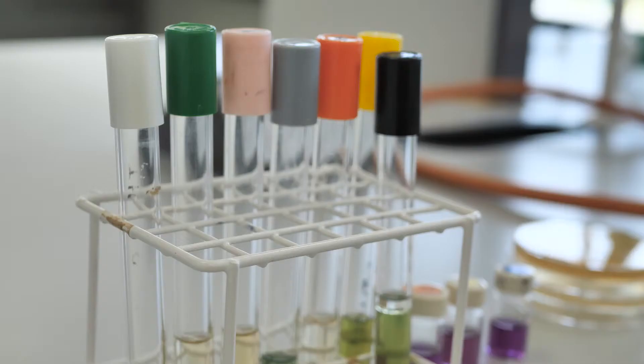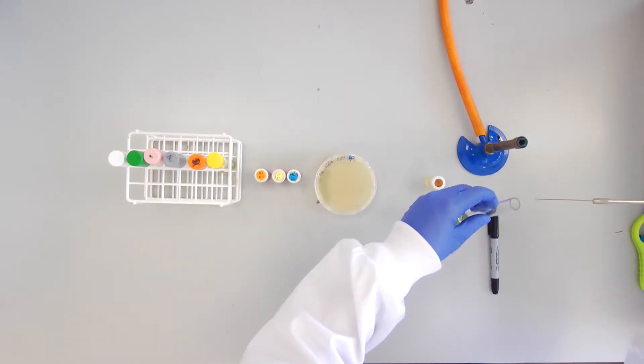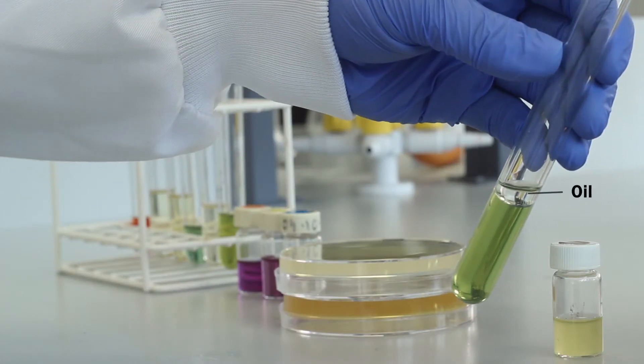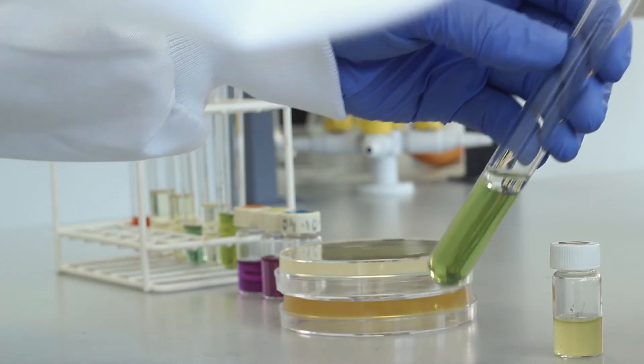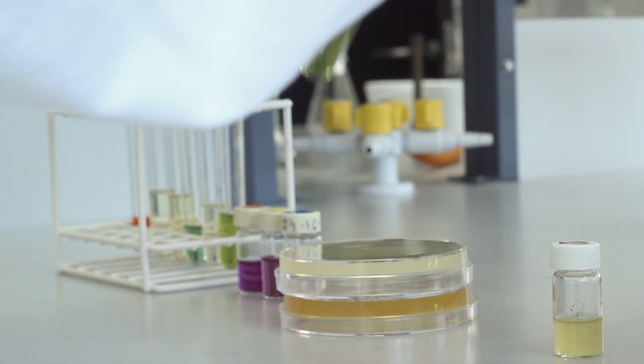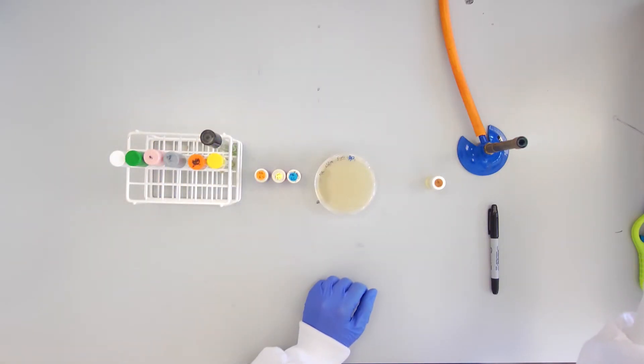Be particularly careful when flaming the loop after inoculating the Hugh-Leifson's test containing oil. Use a part of the flame higher than you normally would use for flaming, that is cooler, as the oil can sizzle and spit.